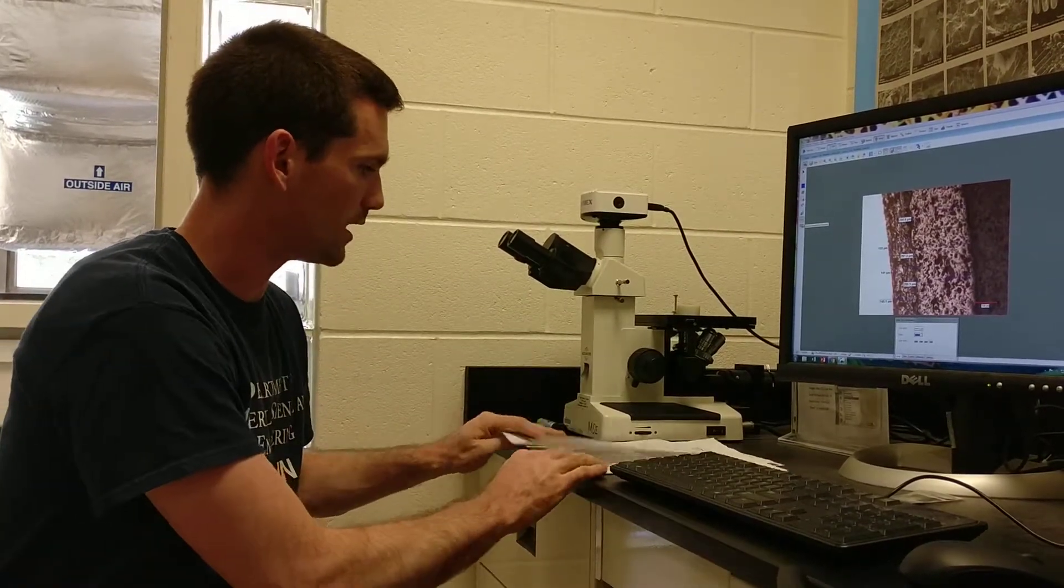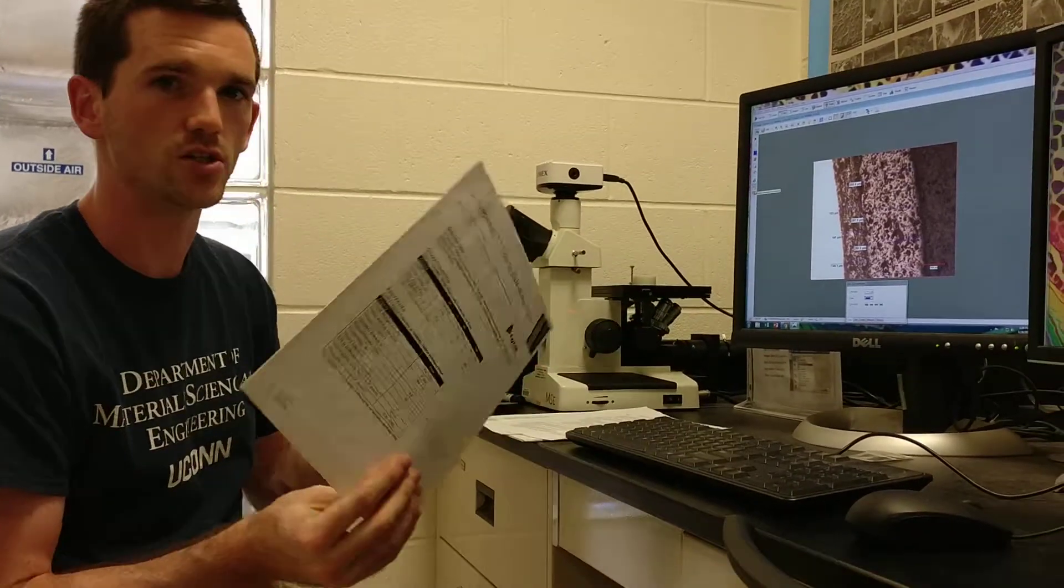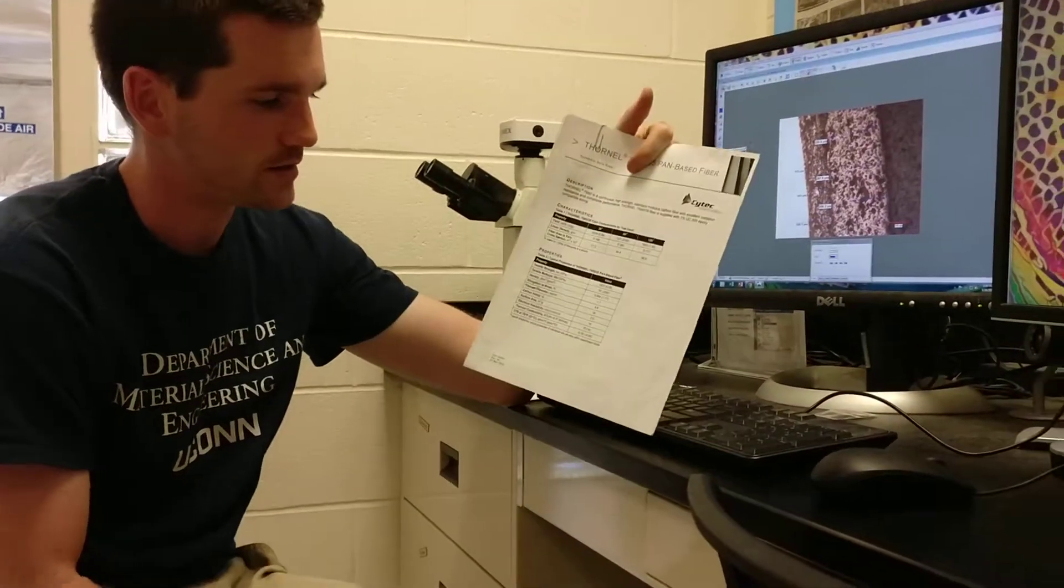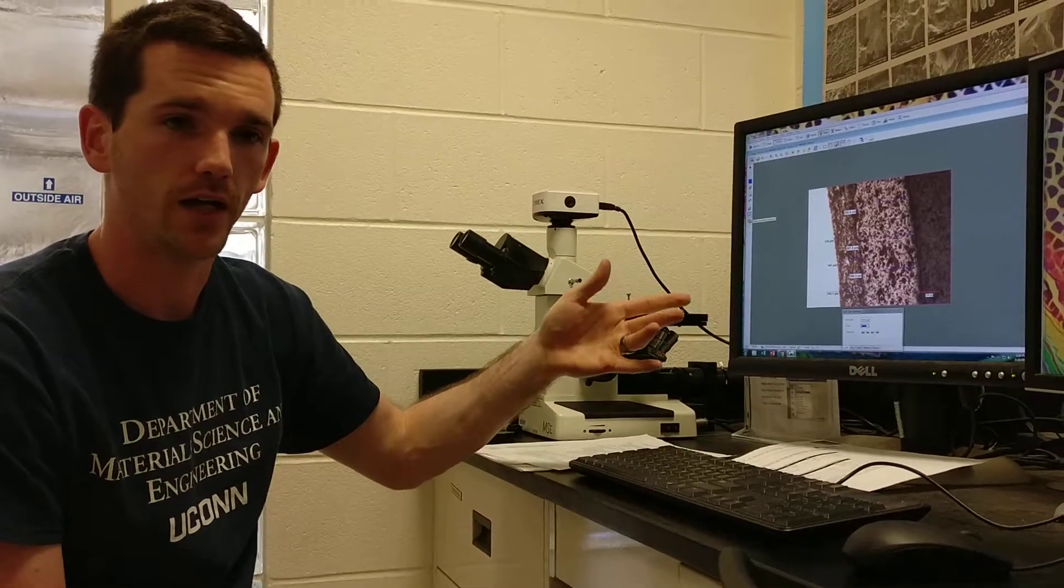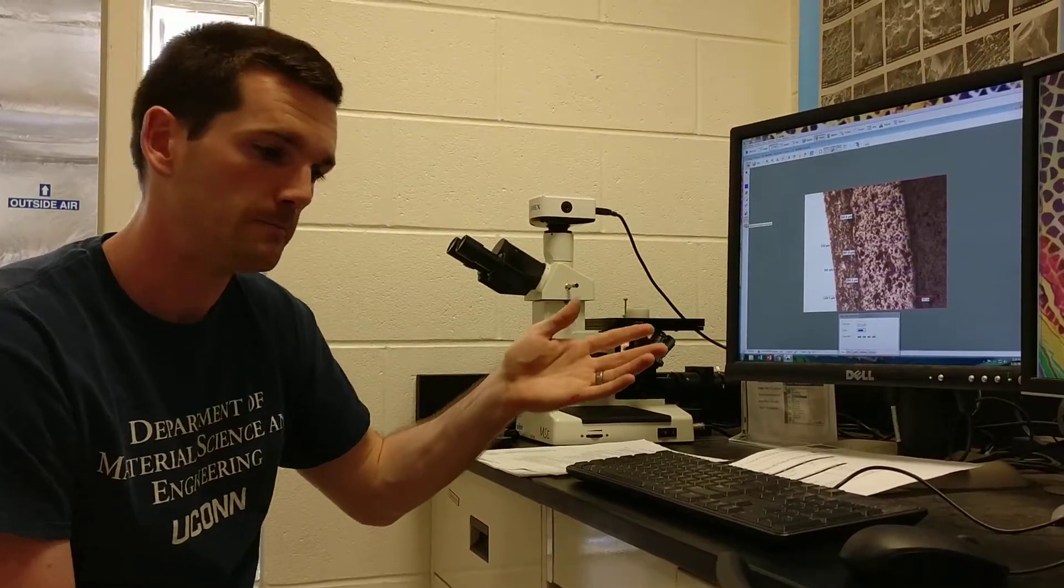Try to get a good section of the carbon fiber to image. We've also got a specification sheet here that lists the diameter of the carbon fiber as 6.8 microns across, so you can double check to see if your measurements are correct. If not, then there's a potential where the microscope should be calibrated to make sure that the line you're drawing is actually the distance it says it is.